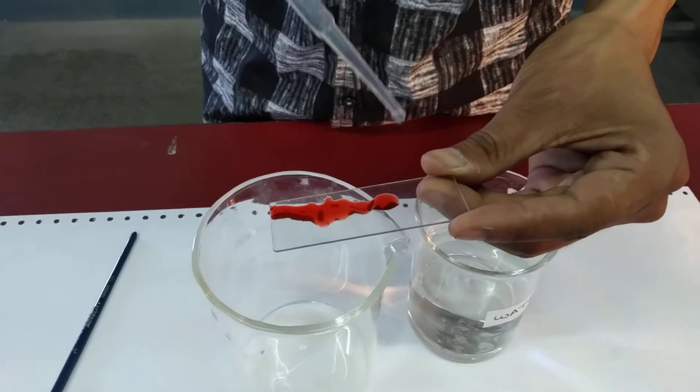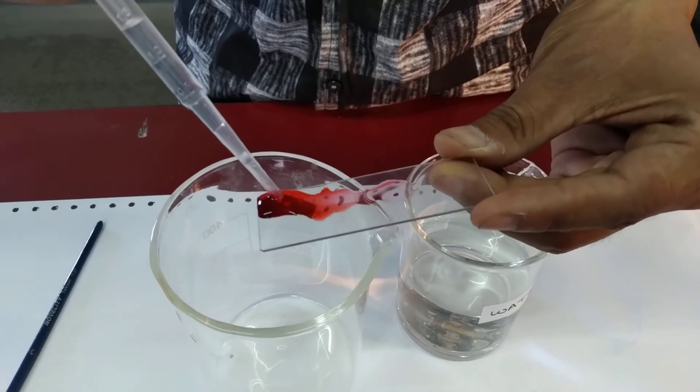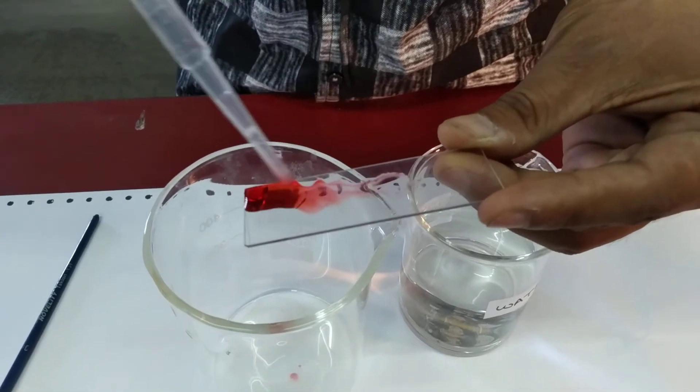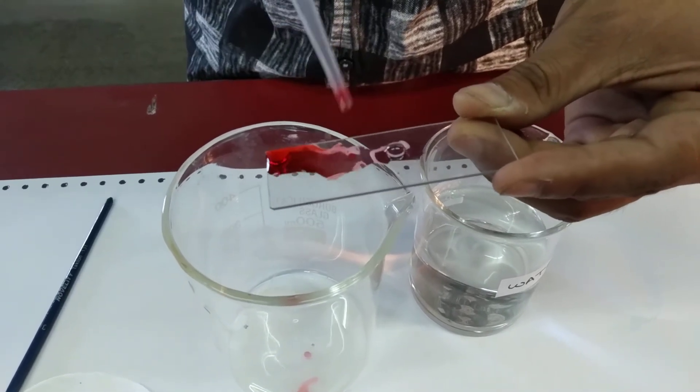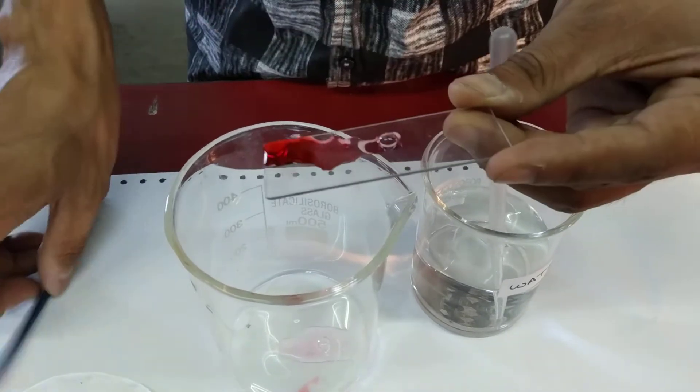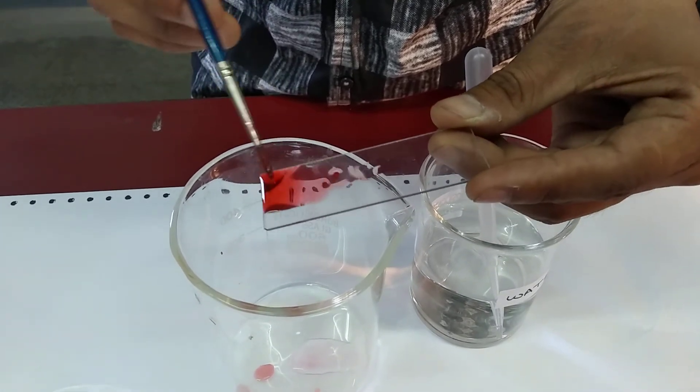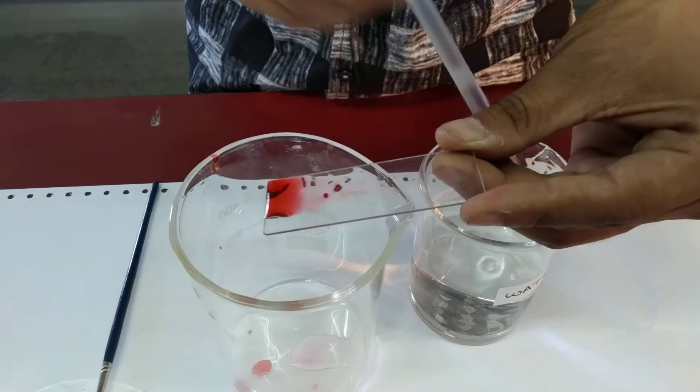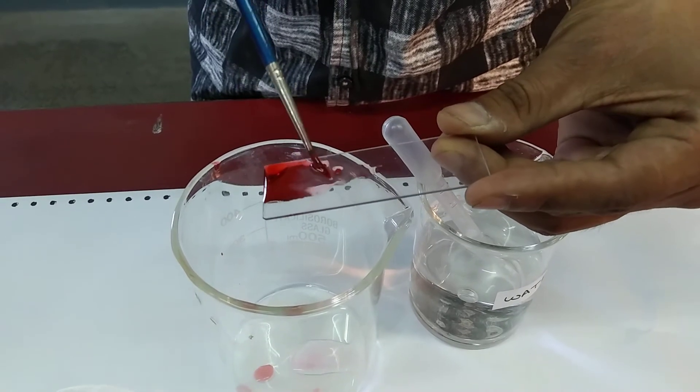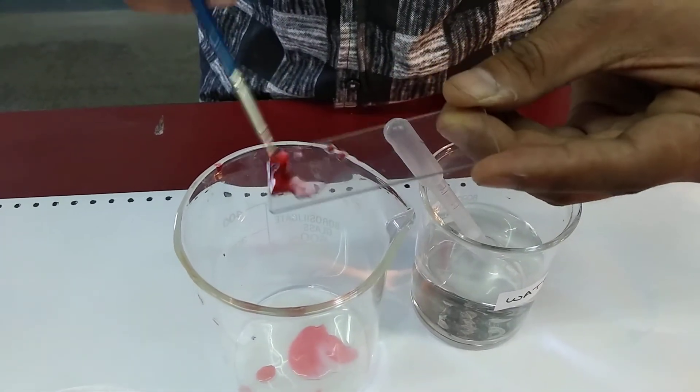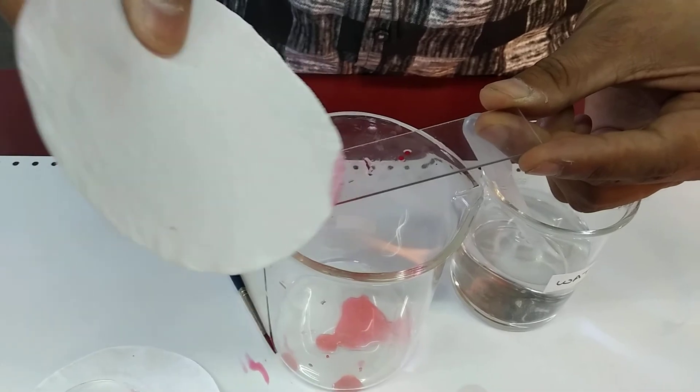After 30 to 40 seconds, slowly wash off the stain using water. When washing, make sure the sections remain on the slide. Be very careful. Wash it off two to three times. After washing off the stain, slowly dry the excess water off the slide with the help of filter paper.